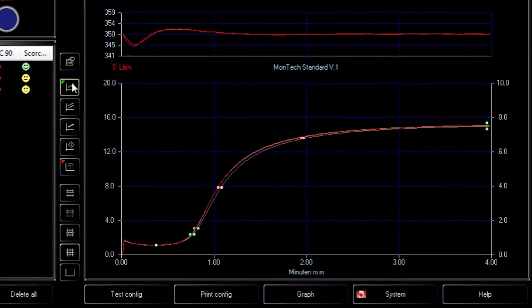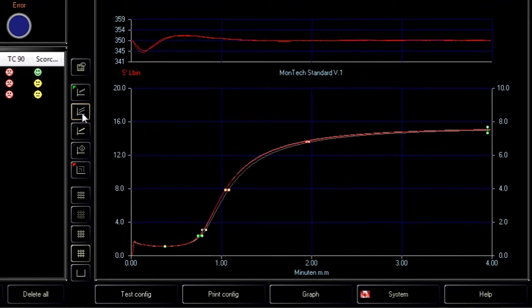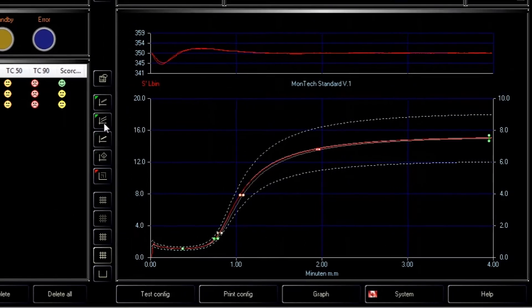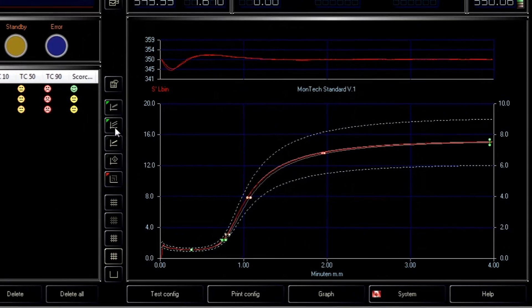Gates, control limits, test cues, graph settings, and display settings can also be created or adjusted.